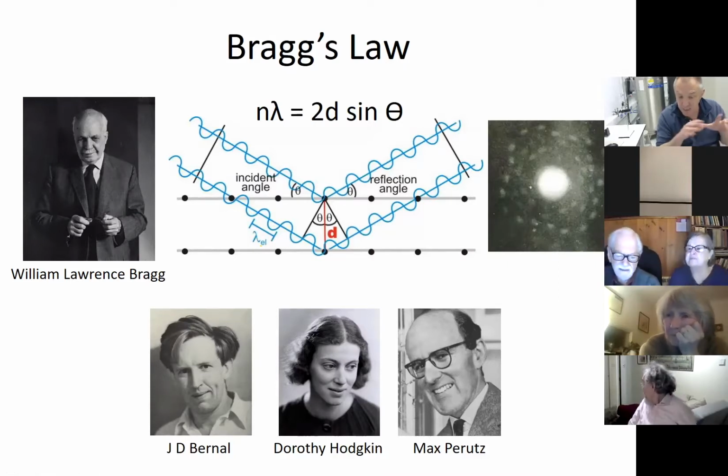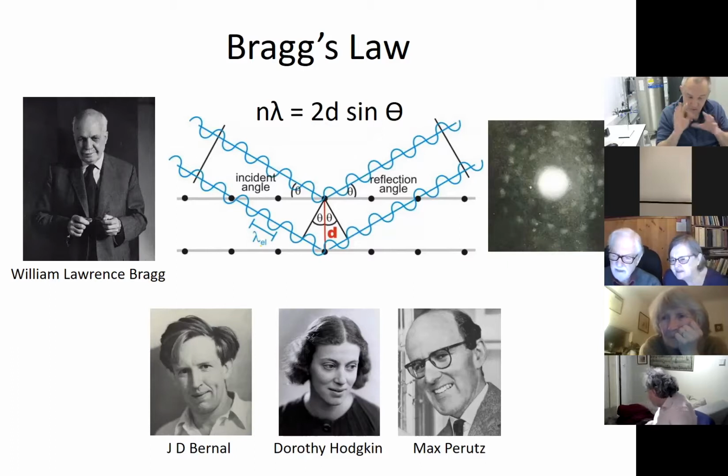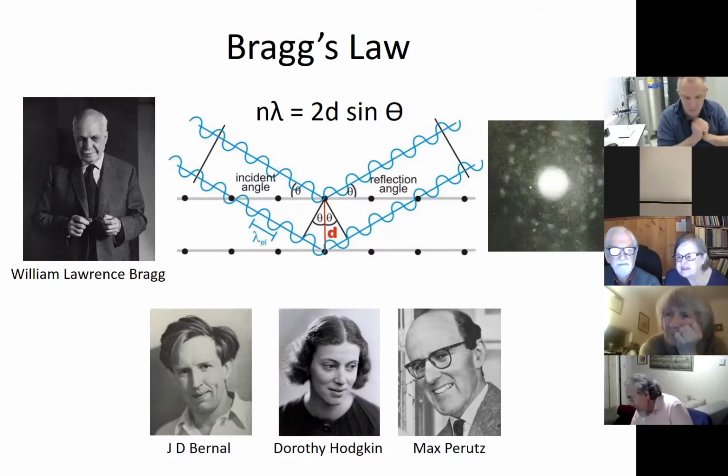Even though there are multiple atoms in this lattice, you can work out that structure by calculating both the intensities of those different spots and also something called their phase. And I'll tell you a bit more about that in a minute. But first, I wanted to let Max tell you a little bit about his project himself and how he was working on hemoglobin and this phase problem.